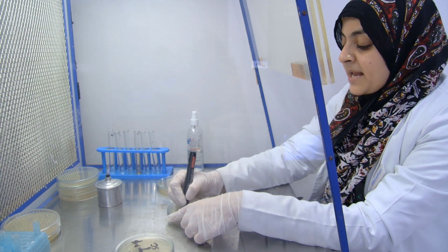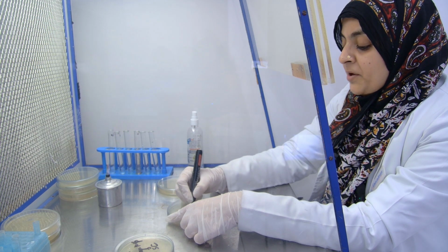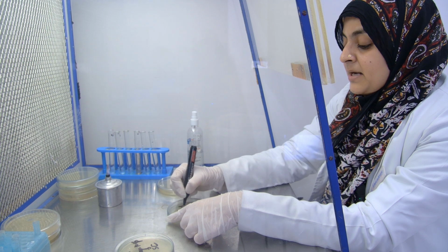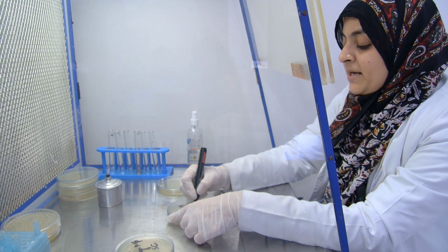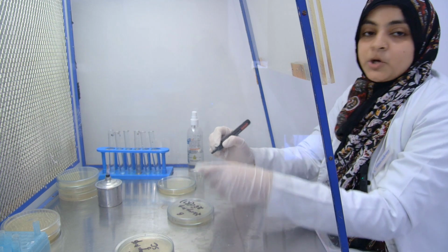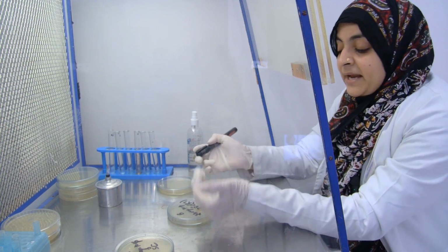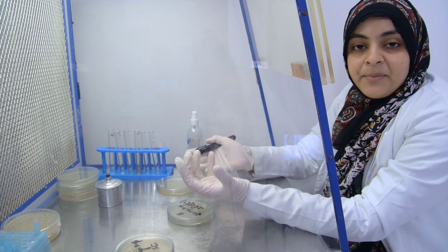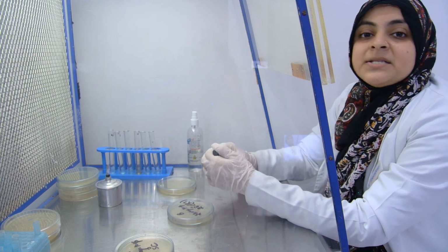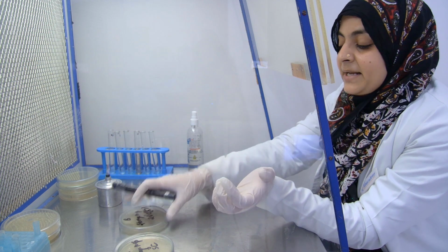Now the second plate is B, and the storage temperature is 28 degrees Celsius. That is today's room temperature. So you have to label the second plate according to your room temperature. Today our room temperature is about 28 degrees Celsius, so we write down 28 degrees Celsius.